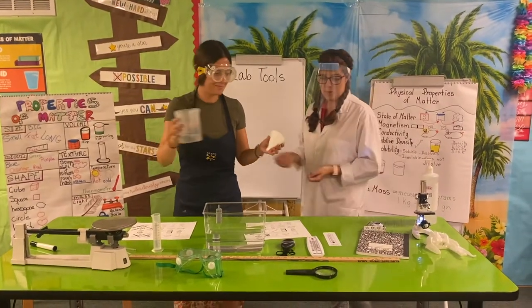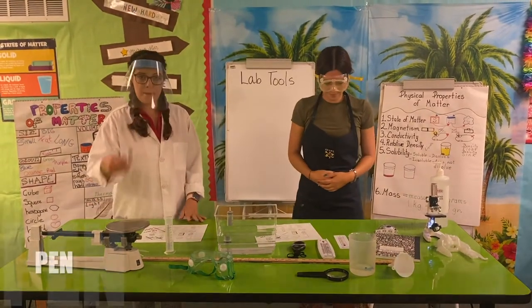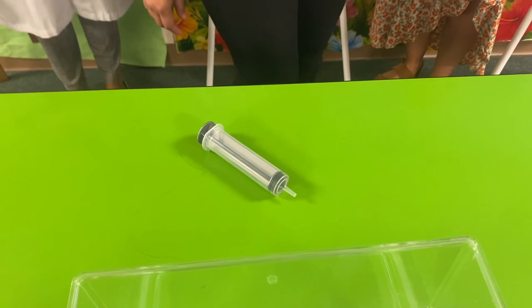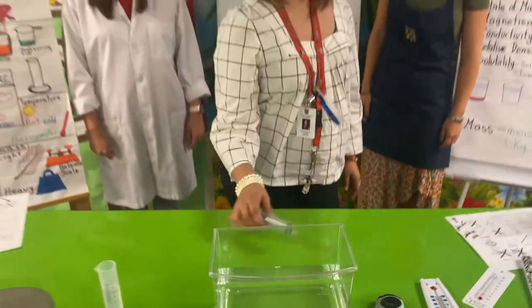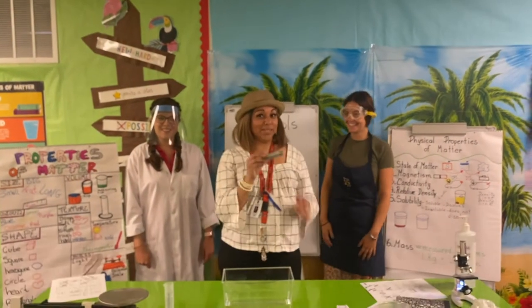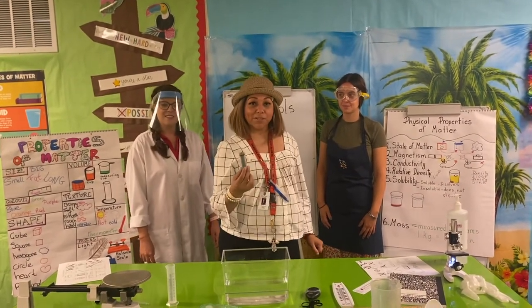And the last and most important thing, you have a pen that you will use to write in your notebook. And ladies, let's not forget the syringe. You're going to need this to add some liquid into some containers or cylinders, beakers, and whatnot.